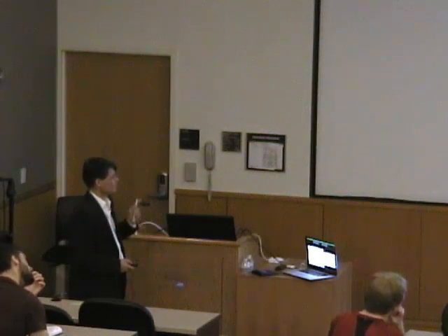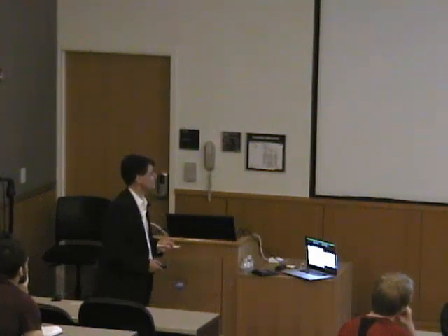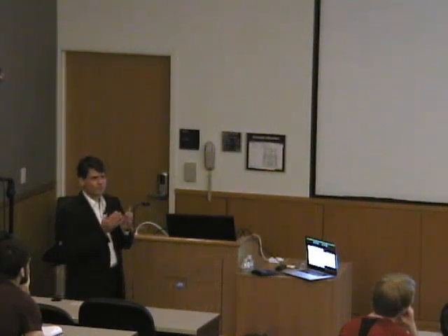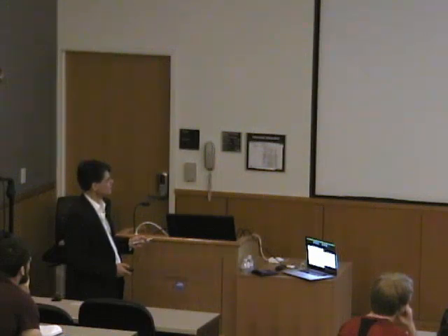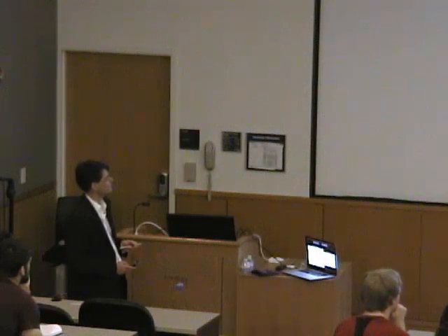But now here's something more important. This is a goodie for those of you who like theory. But now if you want to distinguish experimentally between, say, a d-d transition and a charge transfer transition, you can use the MCD. You use the MCD by taking the ratio of the absorption to the MCD intensity, and that is the so-called C/D ratio. And that is a very effective means to determine whether you have a d-d transition or a charge transfer transition.